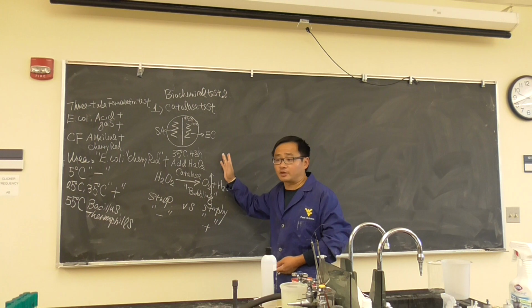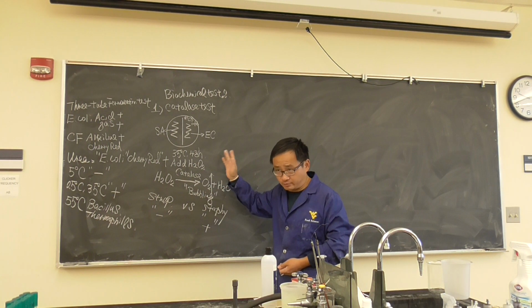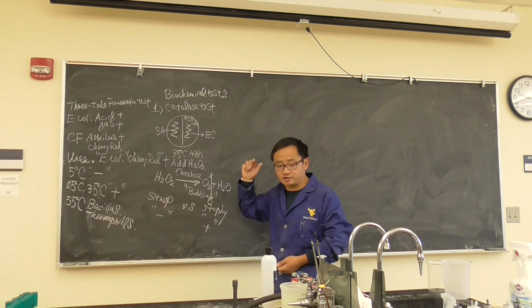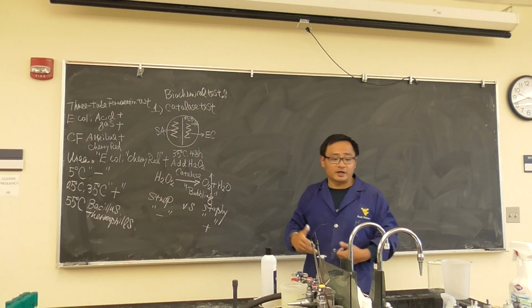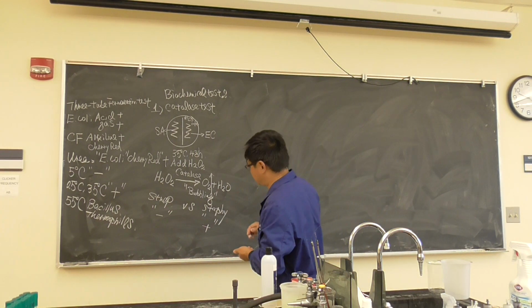Next week, Thursday. By the way, Tuesday there is no lab because we have a lecture exam. Okay, I want everybody to do well, especially the 9:30 lab. If I still have a lab and an exam, then probably the focus is not there, to be honest. Okay, so this is the catalase test.